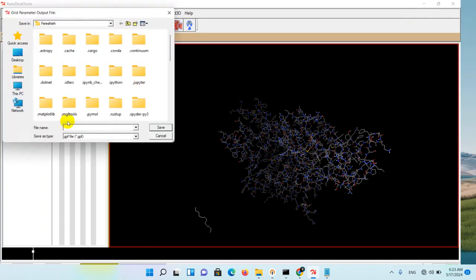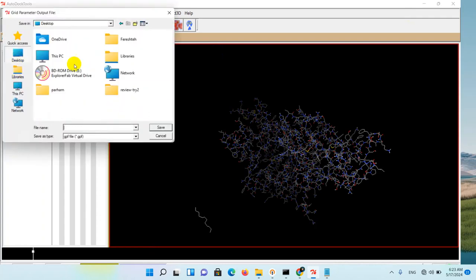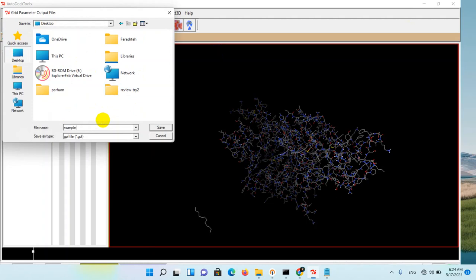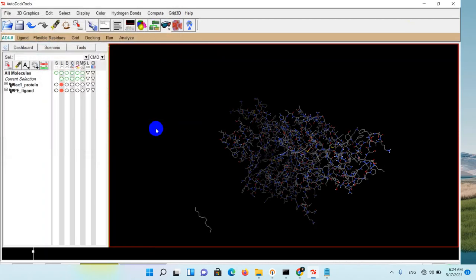For example, I save it to my desktop. For example, one, and the format is GPF file. Save it. Okay, we've done this step.